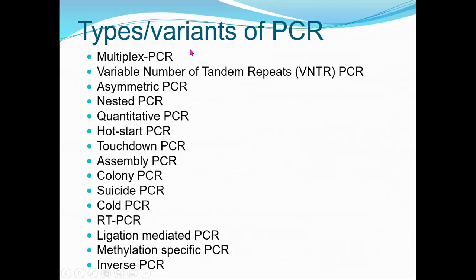So there are several variants of the PCR. In my next talk, I'll discuss these variants.